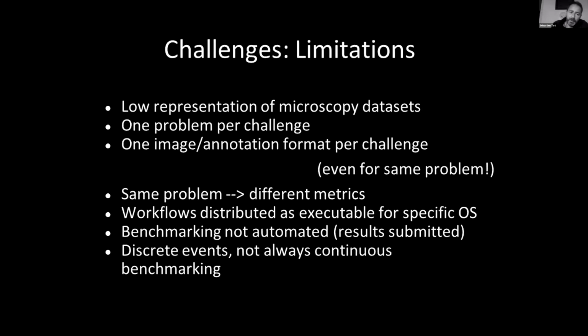And finally, the challenges are discrete events, discrete competitions, often organized during big conferences. So it's not like a continuous benchmarking that would be fully public and updated each time a new workflow is submitted. It's not fully true because some challenges have different editions, but still they are discrete events.